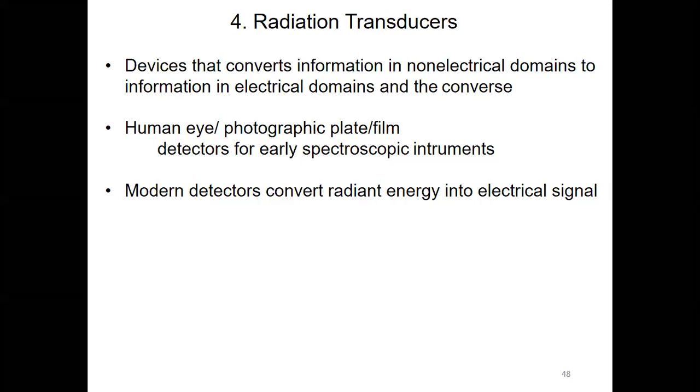So what is happening here? The transducer converts information in non-electrical domains to information in electrical domains. Can you remember in the very first lectures, we discussed the data domains and what are the non-electrical and electrical domains. So when we get a non-electrical signal, the transducer converts that signal into an electrical domain or electrical signal.